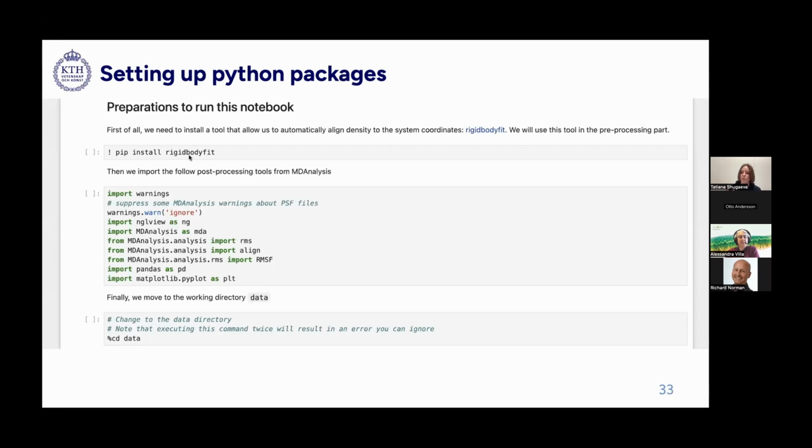First of all, I'm sorry that I'm not showing this online, but I think it's simpler to show it as screenshots. And I will show a lot of code and text on some of the slides, but don't worry about reading everything. I will try to highlight the most important things that you should pay attention to.